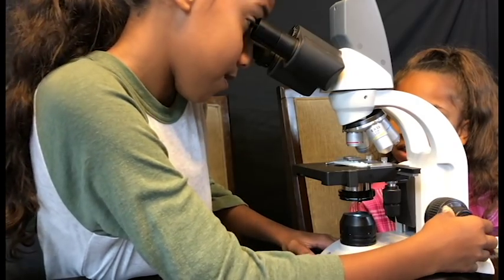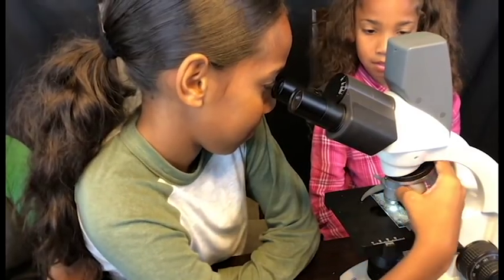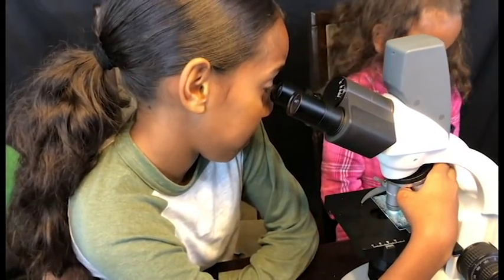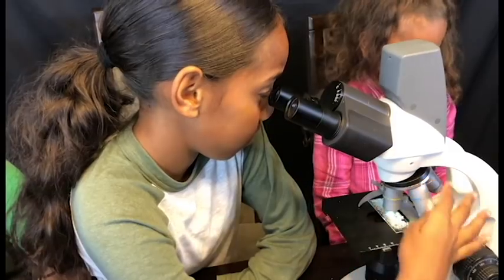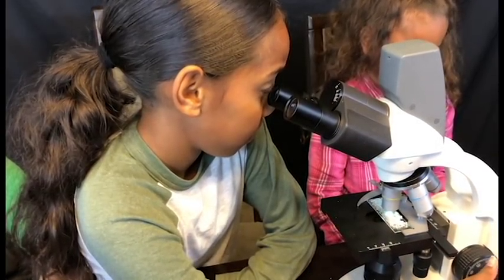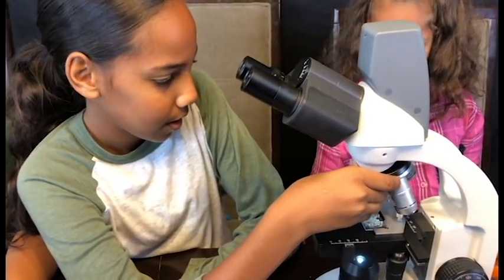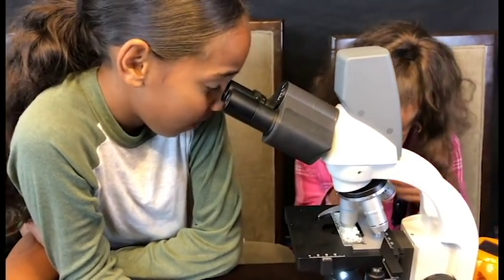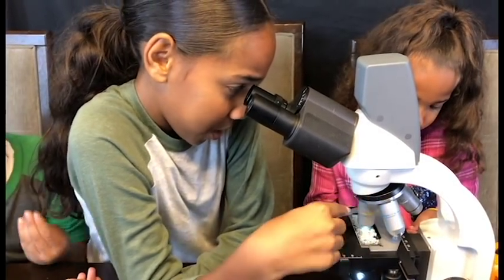I think you guys need to see this too. What does it look like, Jasmine? This one looks like a green blob. You got to focus — this one looks really cool. Wow, that's really cool. Forty times — that one looks like a blob. This one's really cool. The silly string? Yeah. So what does it look like? It's green and some of it is clearer than others.